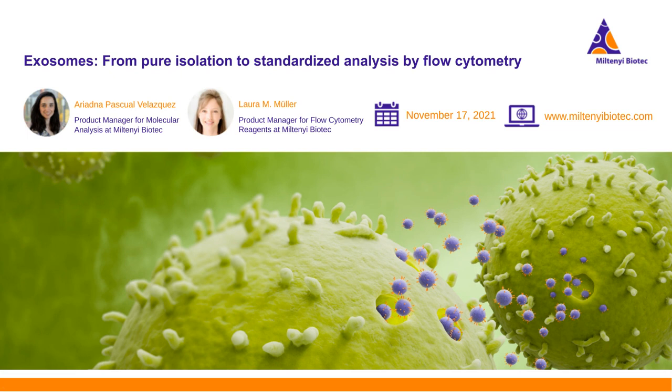Yes, in theory, you can isolate exosomes or other EVs from cell culture supernatant of any kind of cell that you're cultivating. This includes fibroblasts or even neurons, MSCs. Wonderful. Thank you very much.